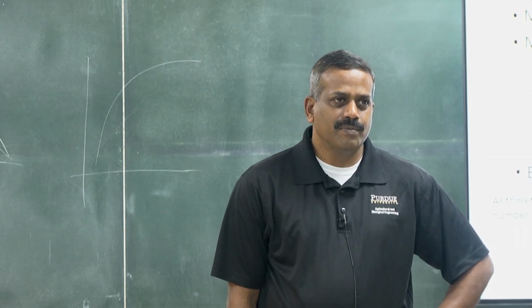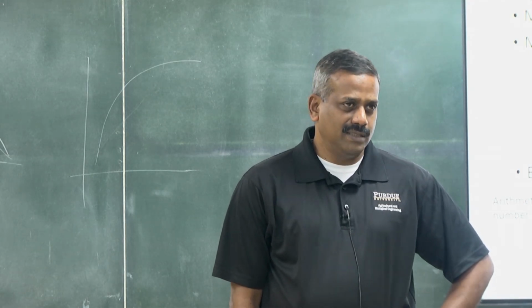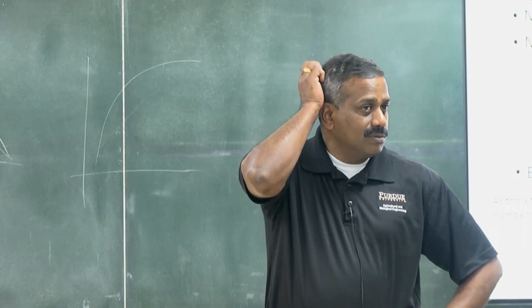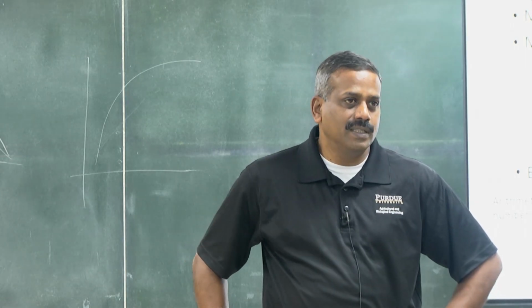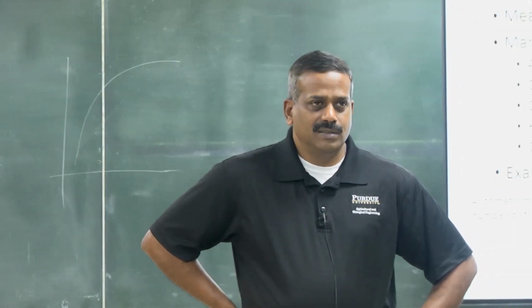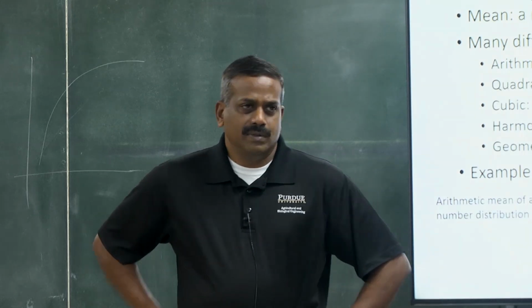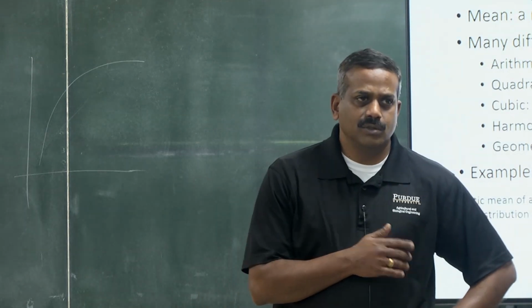Okay. But I think we will briefly talk about particle size distribution effect on flow when we talk about flow. You can do simulation, you can do measurements, that will show. Experimentally, how can we experiment? Shear cell analysis. Do you have a shear cell here?